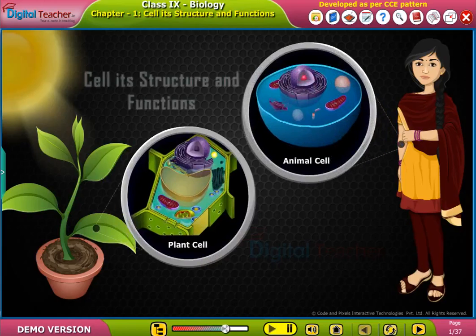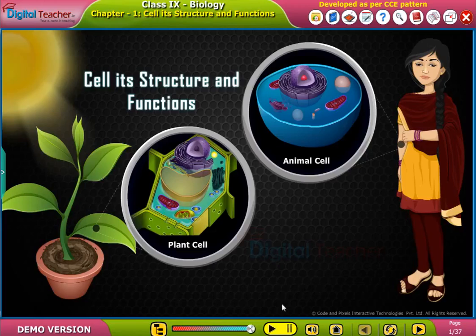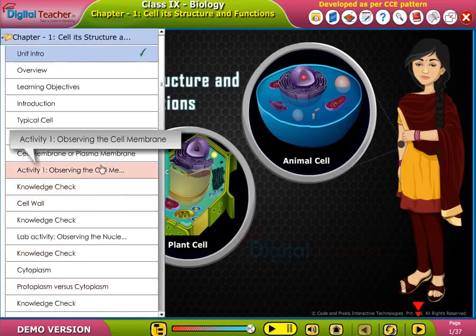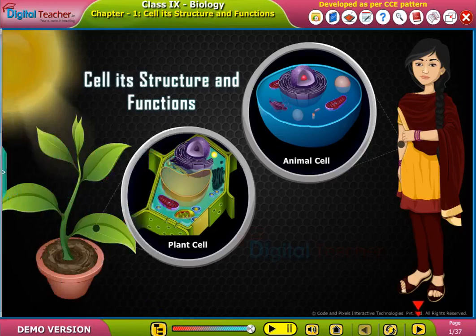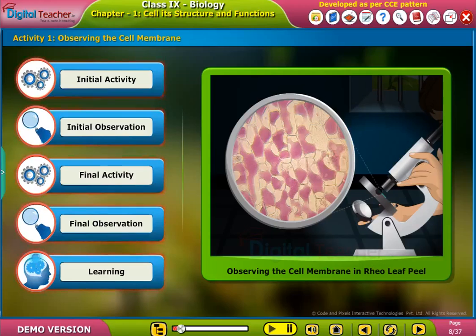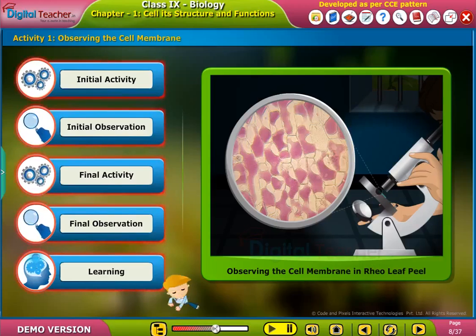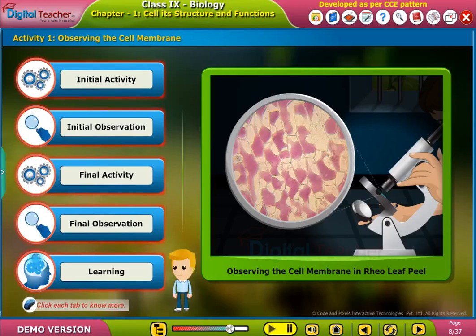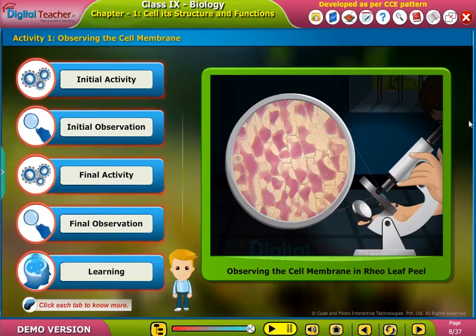Welcome to the chapter. Let us perform an activity to observe the cell membrane in a real leaf. Click each tab to know more.